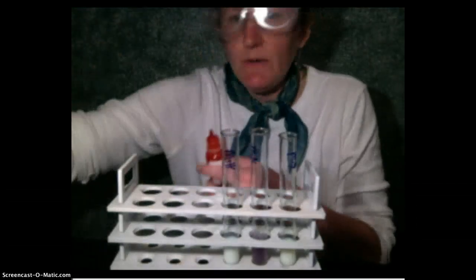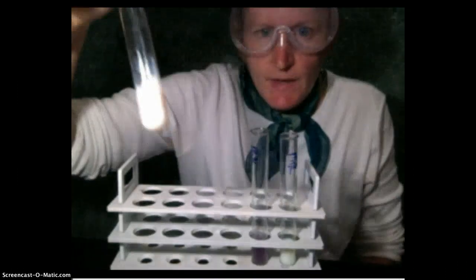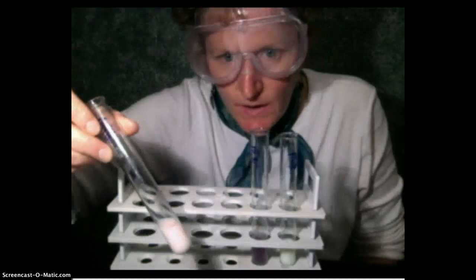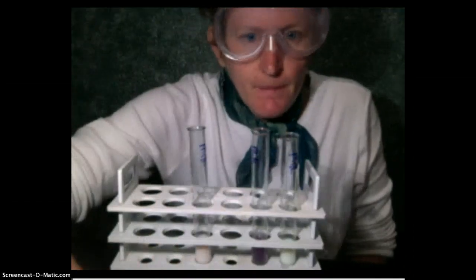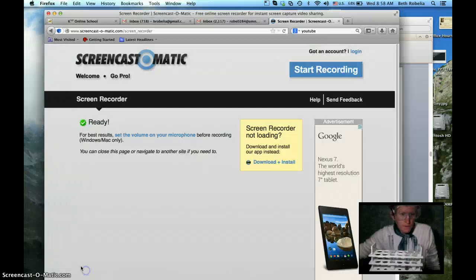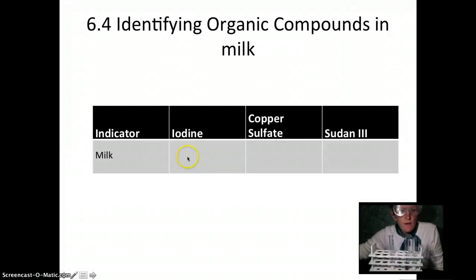When we ask a question of Sudan 3, we're asking about lipids. Let's see what happens when we add Sudan 3 to milk. Not really a color change there, it's really just pink.